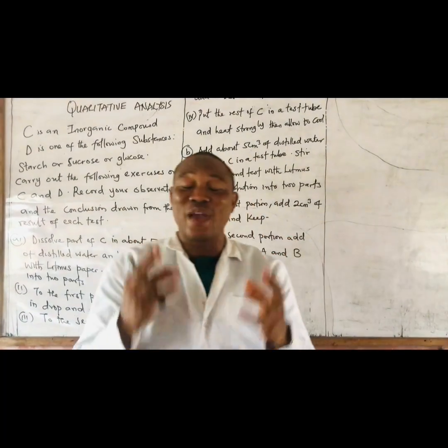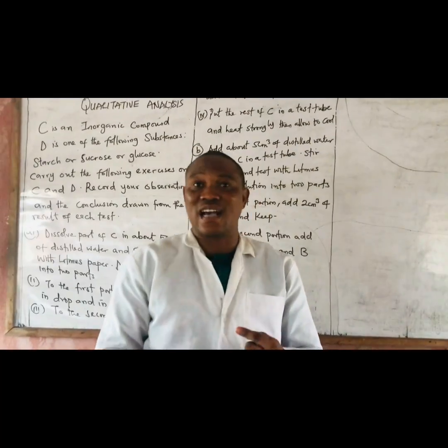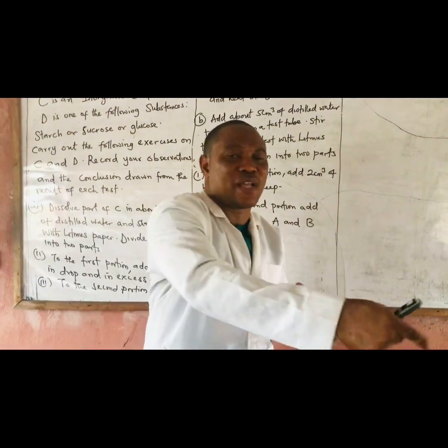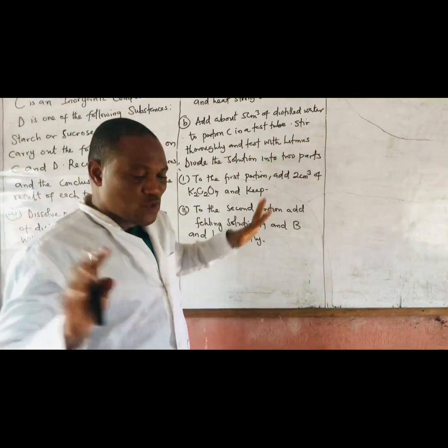And from your basic chemistry classes, when you observe something as a chemistry student or science student, you must be able to infer. If you see this, what is this very particular thing I saw? What is it trying to say? And that's what covers this aspect, qualitative analysis.